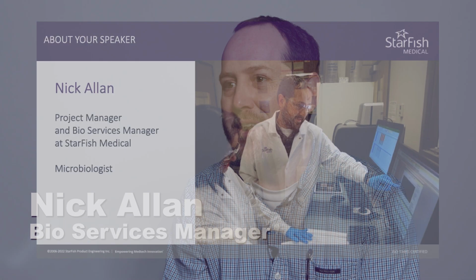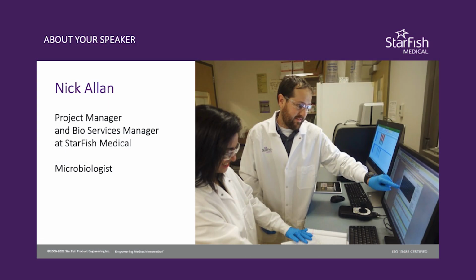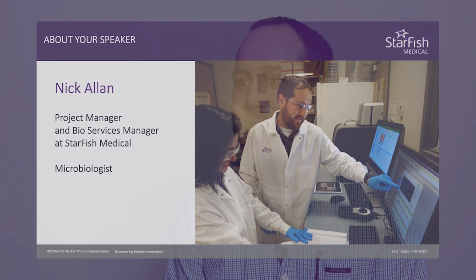I'm the functional manager for the bioservices group here at Starfish Medical. One of my areas of expertise, if you will, is biofilm growth. And as a researcher, I was really interested in how biofilms of microorganisms grow on implant medical devices. And that's an interesting concept because it's fine to grow microorganisms in a culture flask, but in order to grow them on a medical device, you need a surrogate and a way to screen them in a high throughput way.